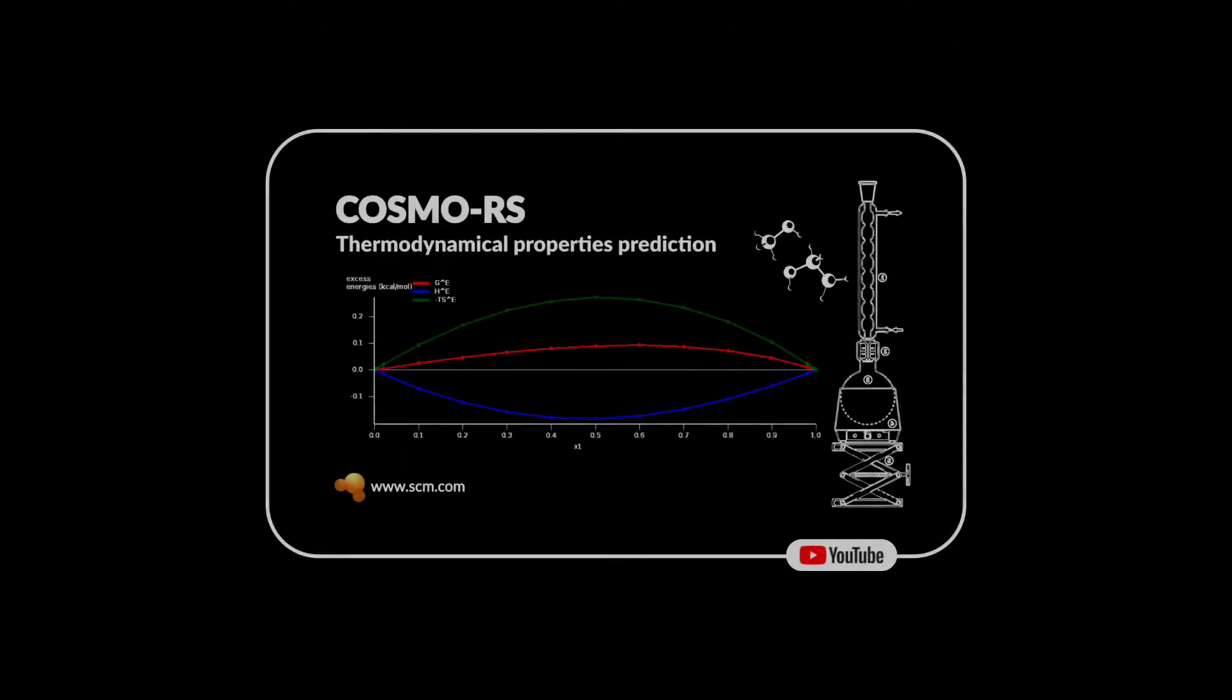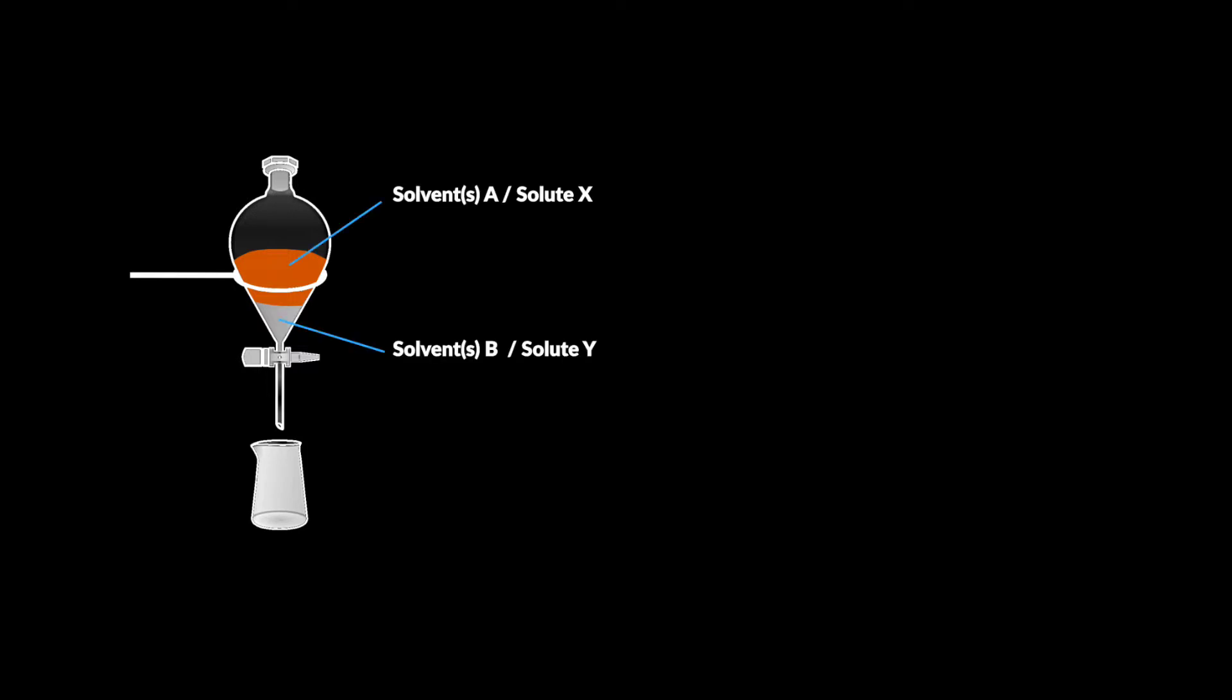In a recent video I demonstrated the basic usage of our thermodynamics code COSMO-RS. Today I would like to show an interesting use case in which a solvent mixture for liquid-liquid extraction is optimized.